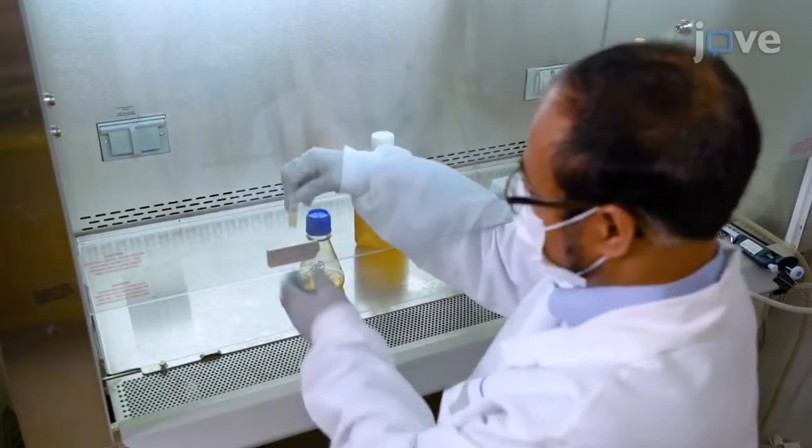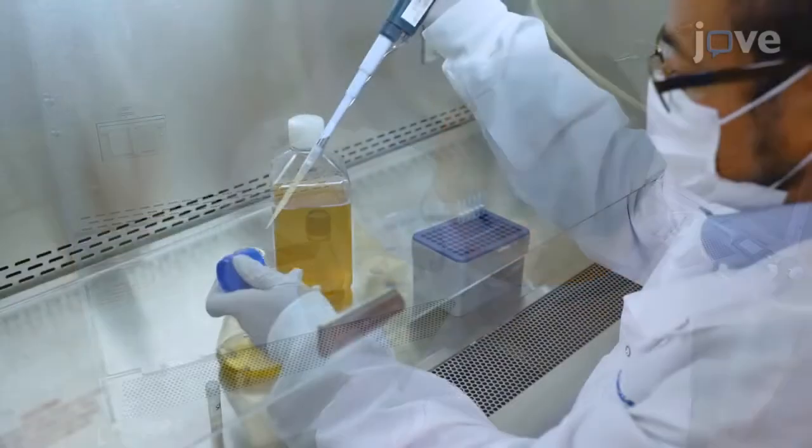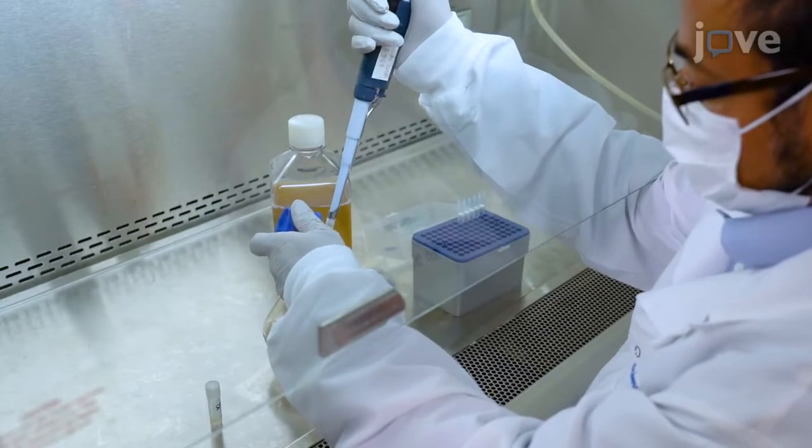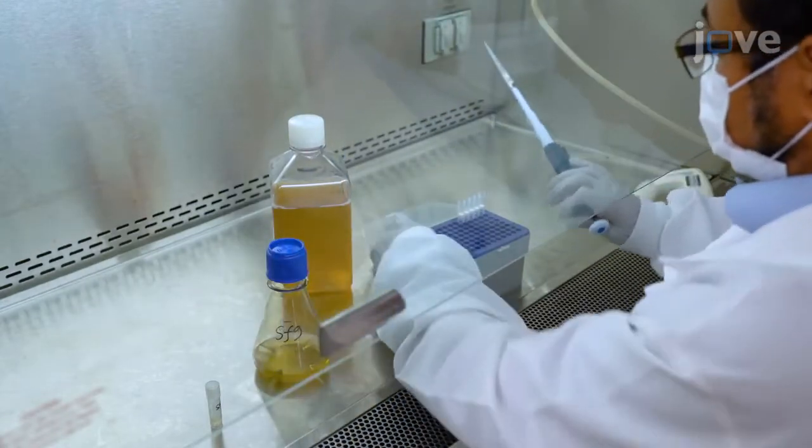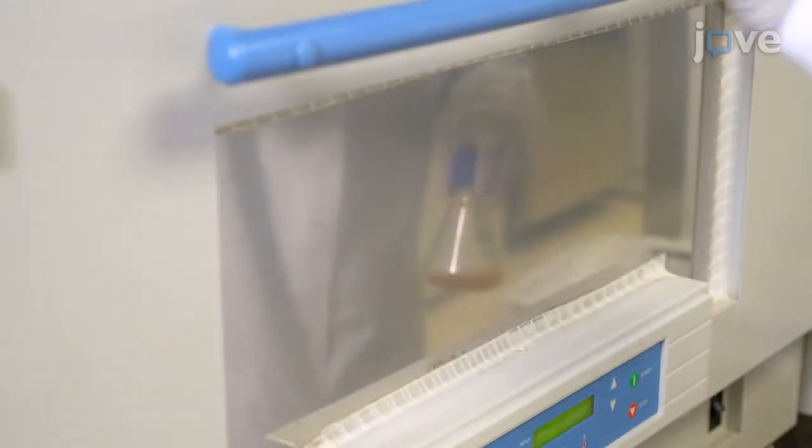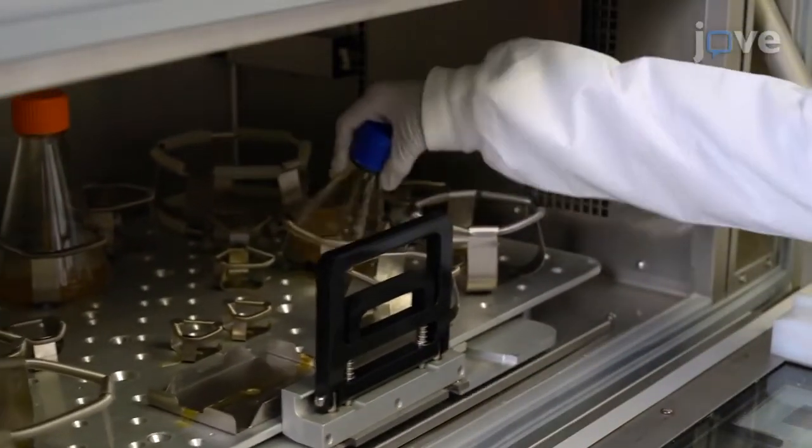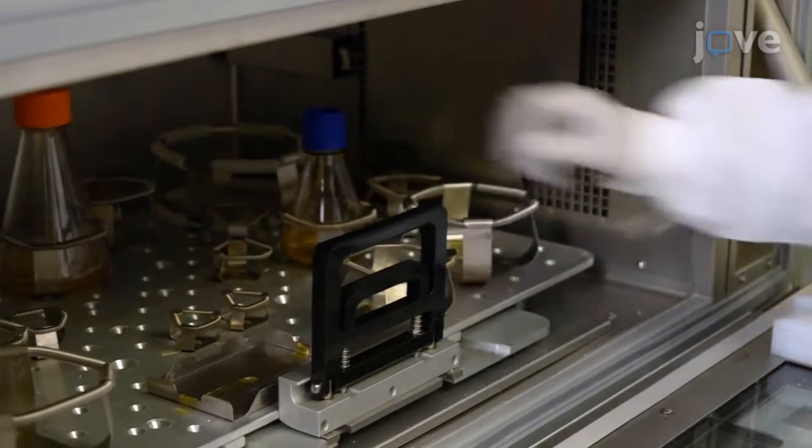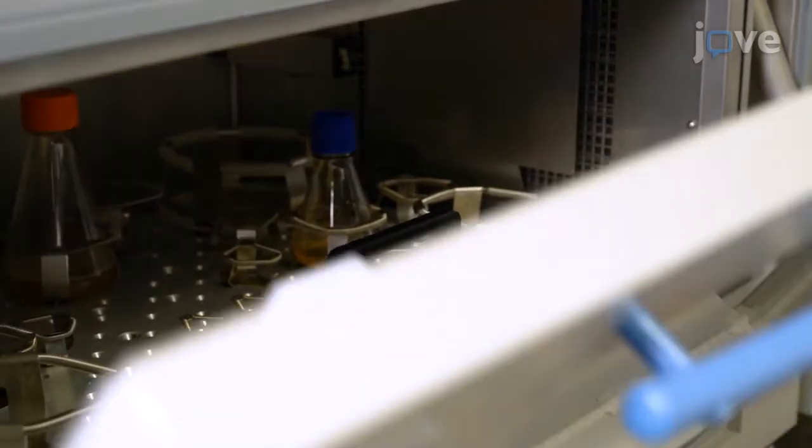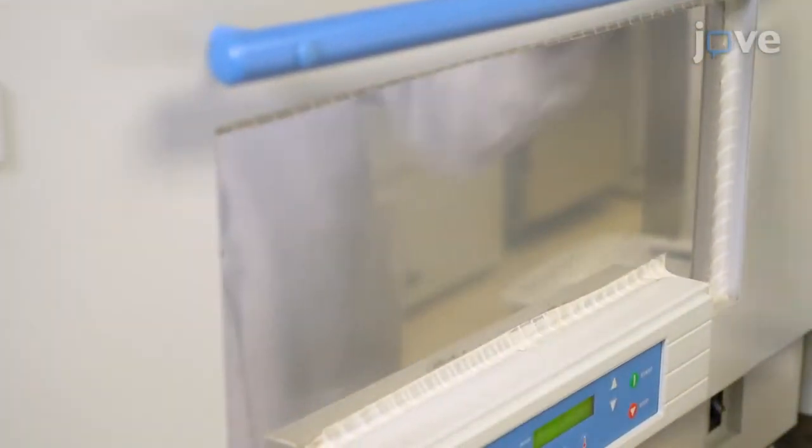Begin by thawing one vial of SF9 cells and immediately seed them in 50 milliliters of insect cell culture medium. Grow SF9 cells in an orbital shaker incubator at 125 rpm and 28 degrees Celsius in round bottom flasks with a loosely attached cap for exchange of air.